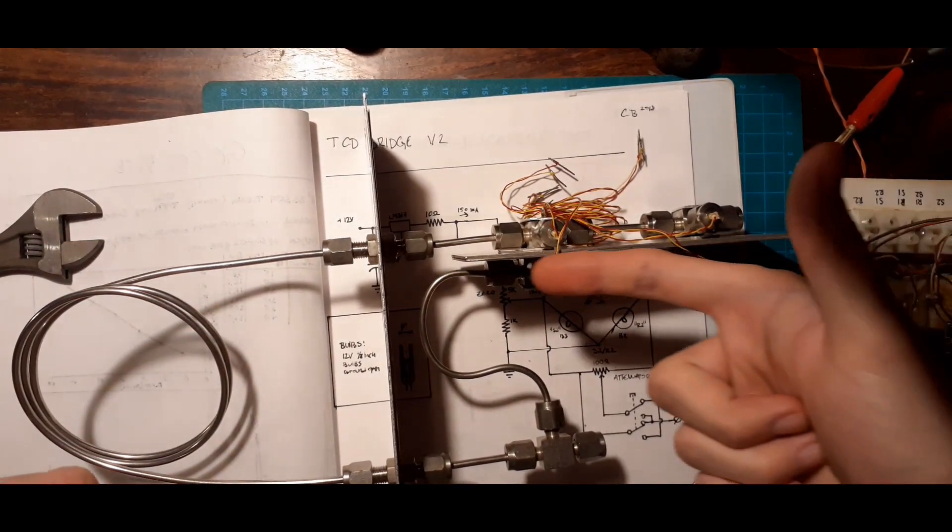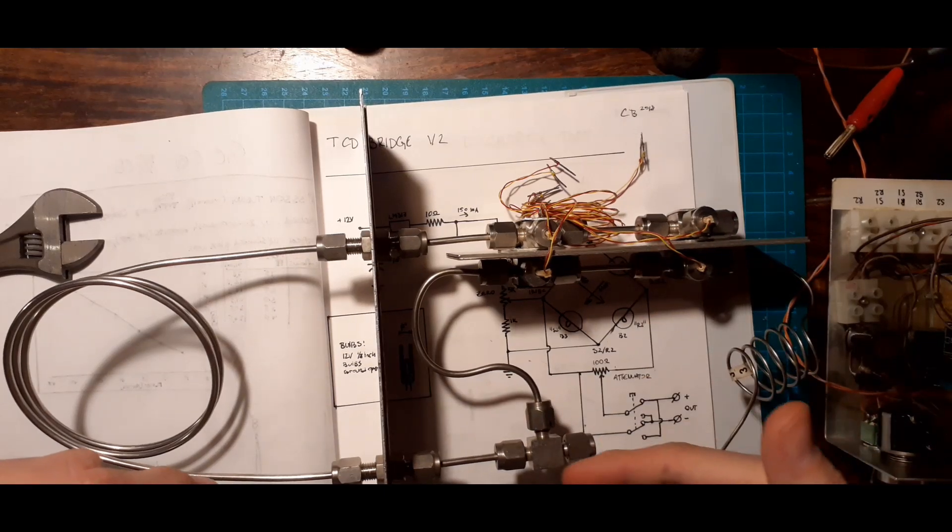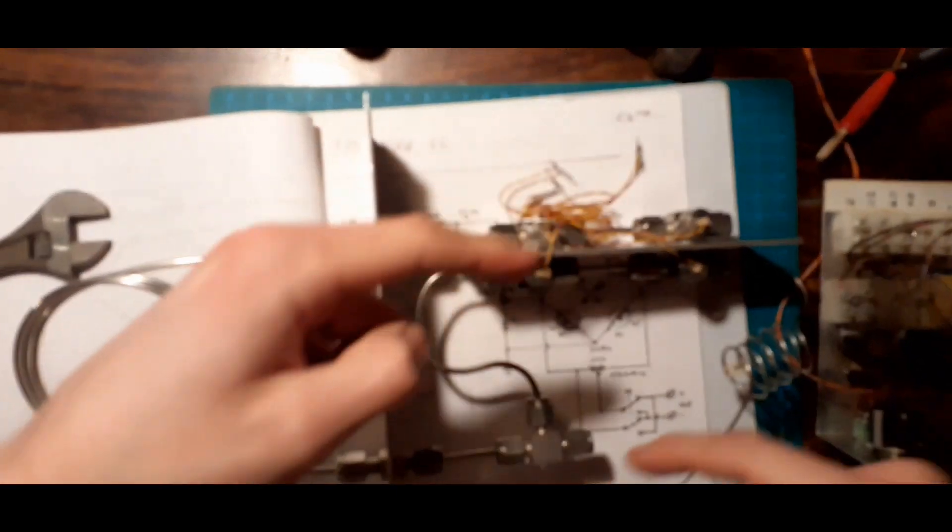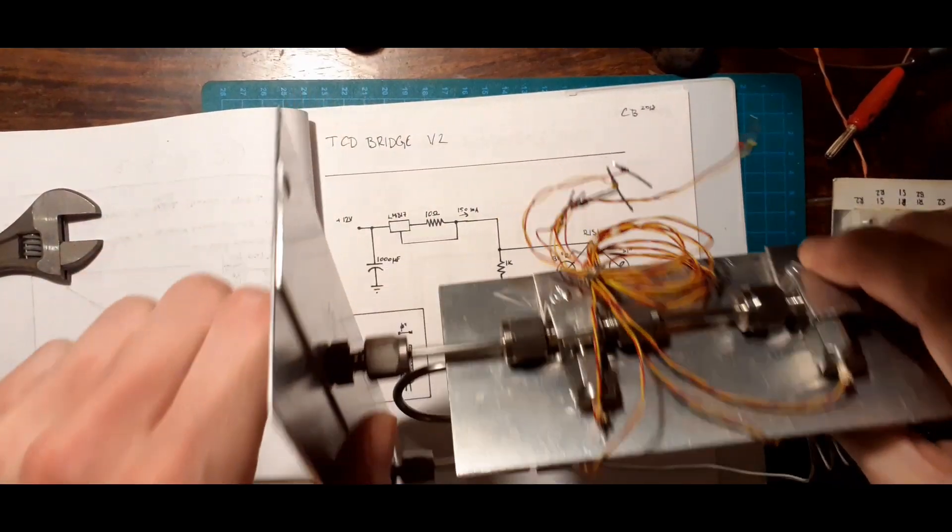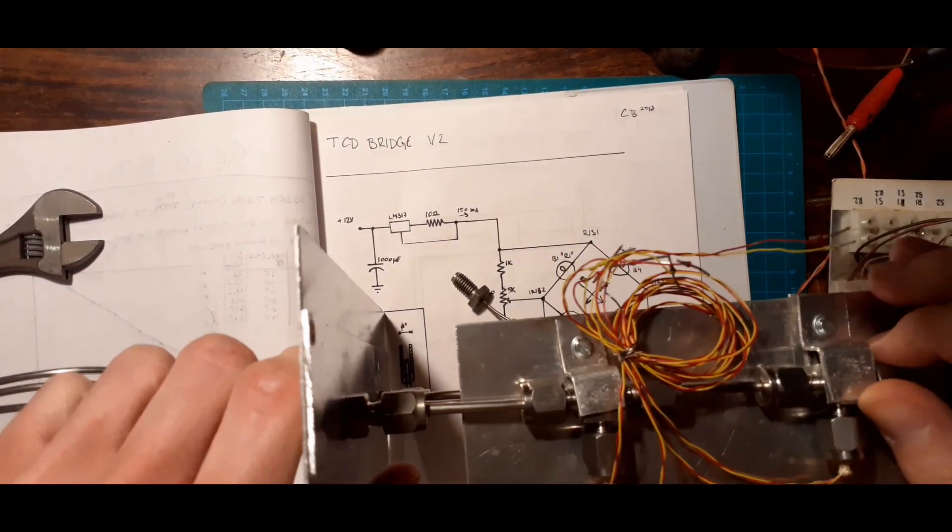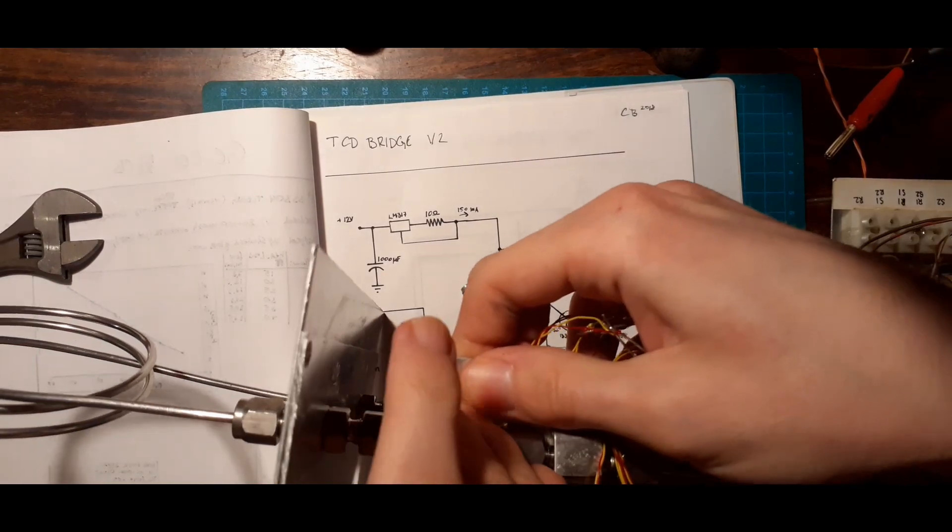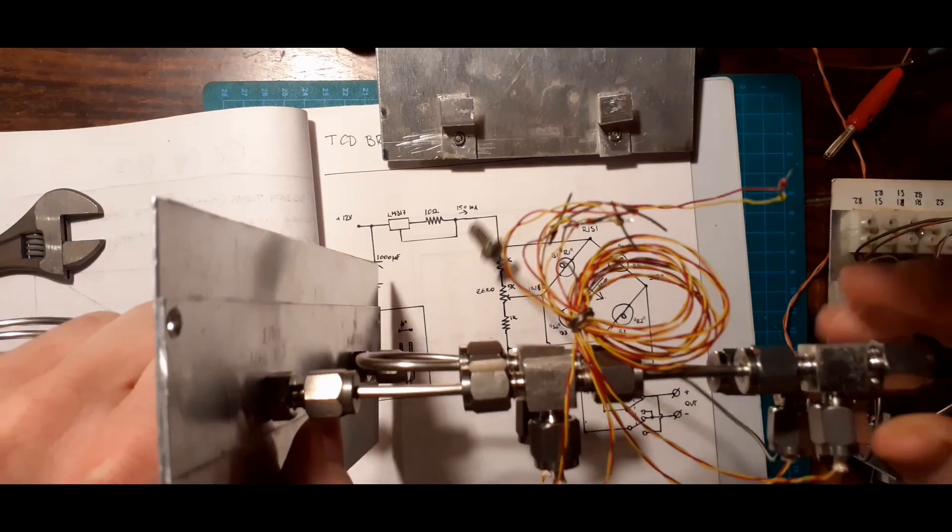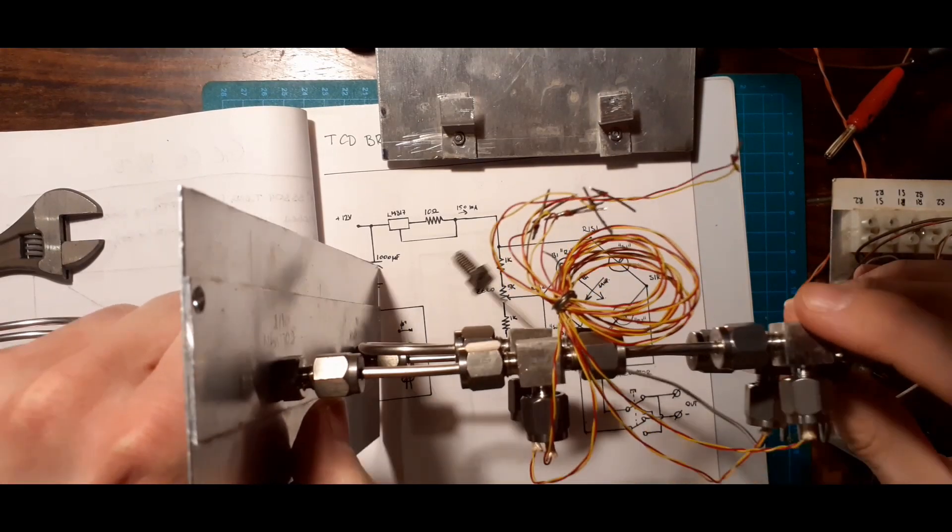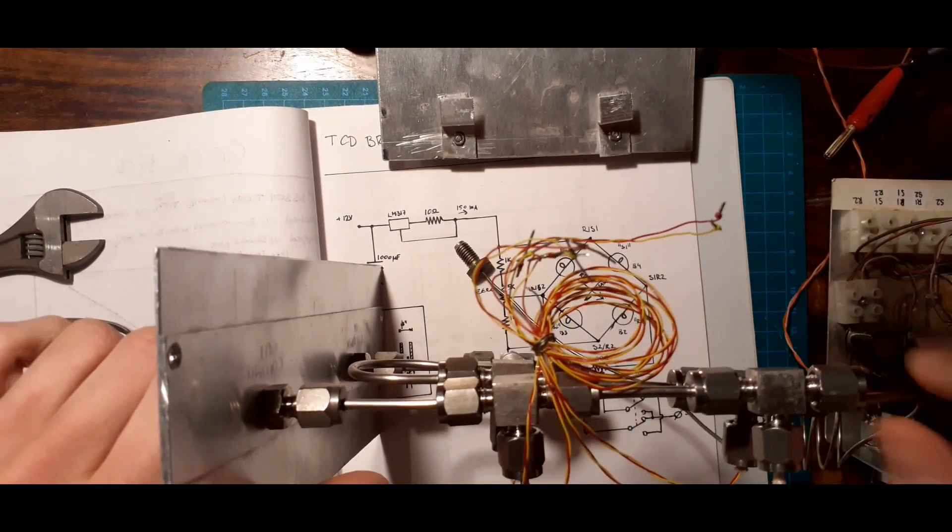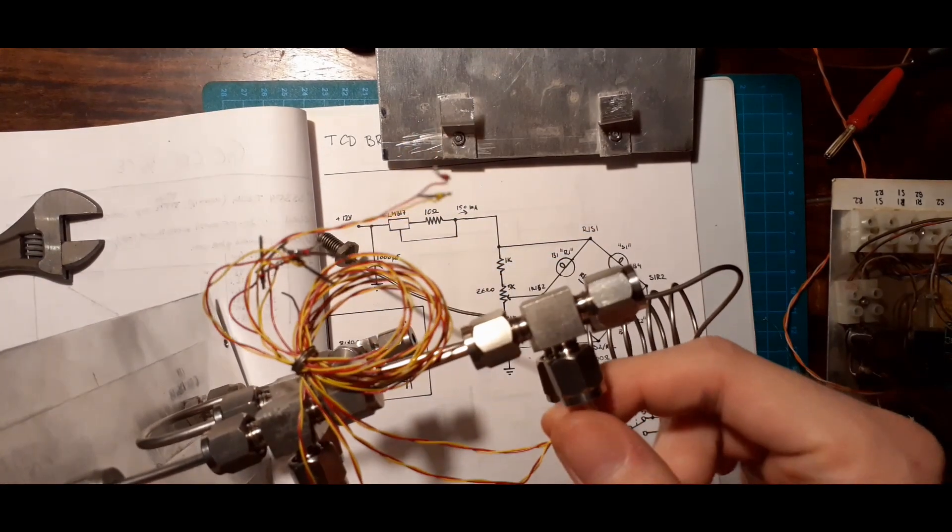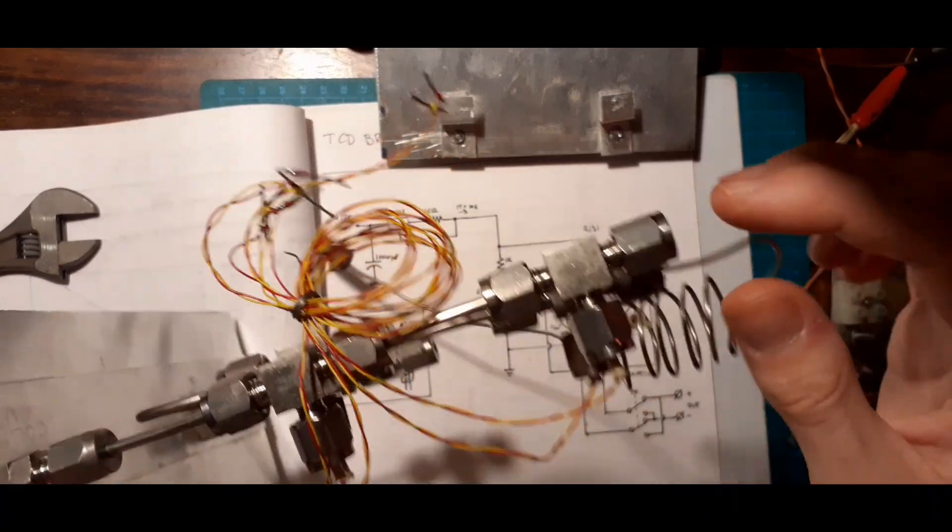This is the reference side, comes in here, this is the injection port, column, and output side of the detector. And you see I'm using these little T fittings here. Let me go ahead and take... this is just an aluminum block I've mounted them to in order to try and equalize the temperature of them. I had them heated at some point as well. But this is just a T fitting, standard Swagelok. Okay this isn't Swagelok, but knock-off Swagelok fitting.